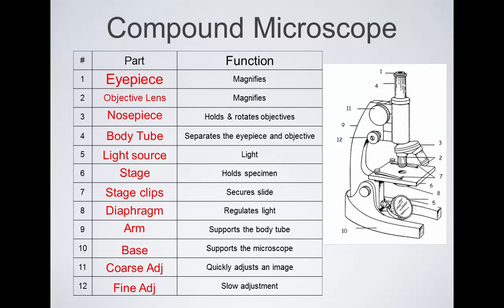All right, so tomorrow we'll actually get to use some of these microscopes and look at some things under them. But those are the parts, and that's going to be the focus of your quiz on Monday.